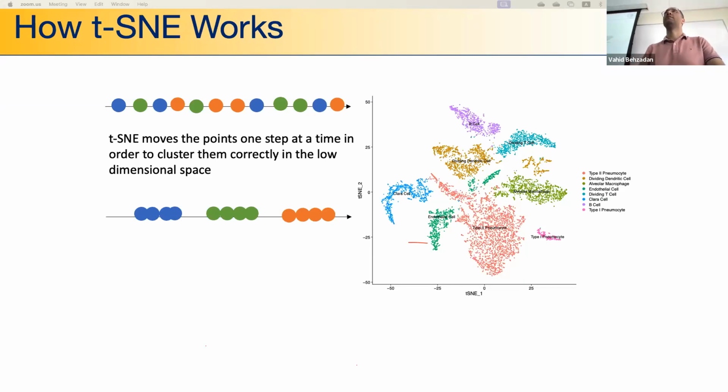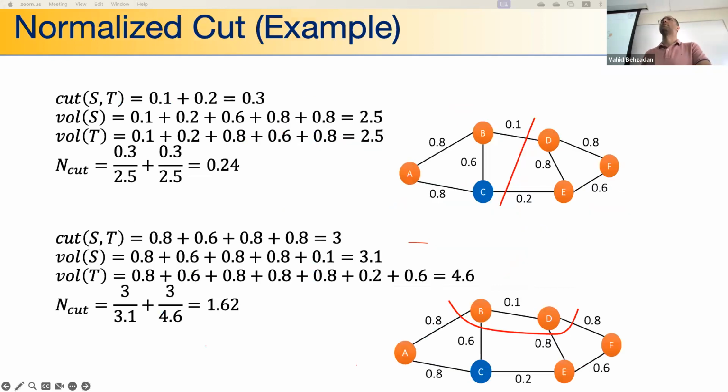Can you go back to the slide with the 6 cells or 6 genes connected with each other? When you graph, yes. My question here: the red and the blue spots, these are cells? Yeah, these are cells. It means that there is interrelation between the cells with each other.